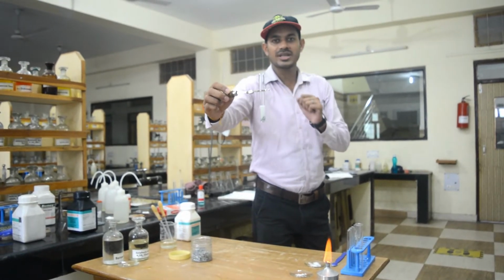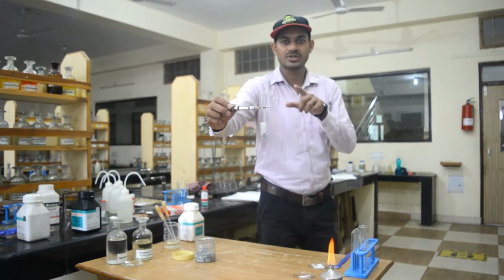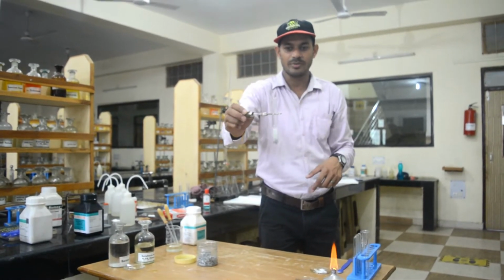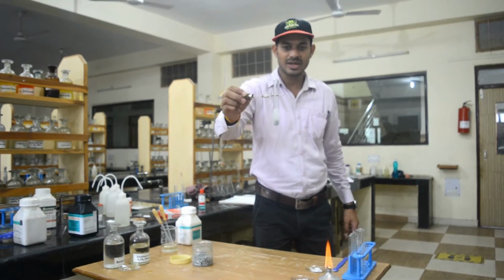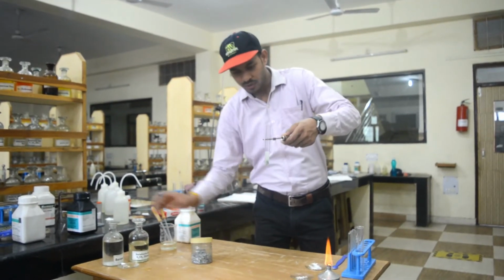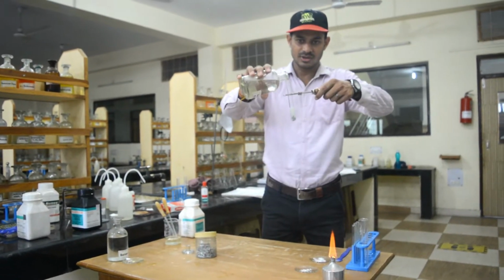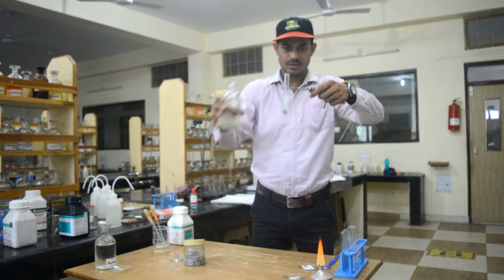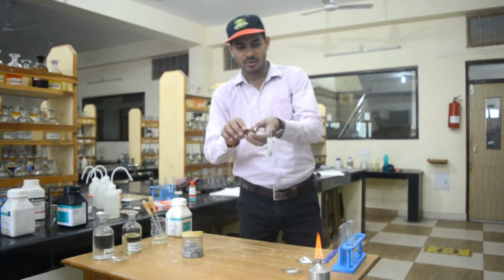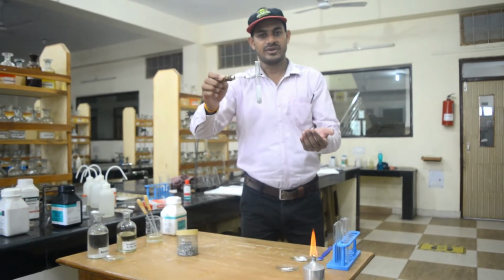Hydrogen is less reactive than zinc, so zinc is reacting with the sulfuric acid, displacing the hydrogen and forming zinc sulfate. When this reaction takes place, hydrogen gas is formed. I will add some more acid because the reaction has stopped; the amount of acid compared to the zinc is less. So zinc is reacting with the sulfuric acid and forming a white salt, zinc sulfate. It is indicating the displacement reaction.